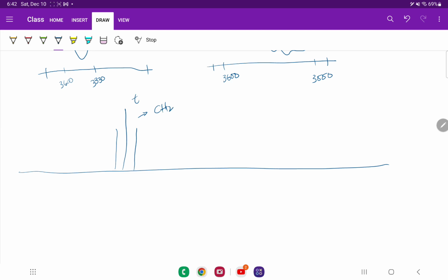Now, we don't often see coupled NMR because of the ratio of hydrogens to carbon. Sometimes that signal gets a little bit muddy. So let's review just a few more examples. If you had a quartet, that would be a carbon with 3 hydrogens. So it's the carbon plus its neighbors to give you that signal. If you had a singlet, it's a carbon with no hydrogens. If you had a doublet, it's a carbon with 1 hydrogen. And so remember, those are the letters.